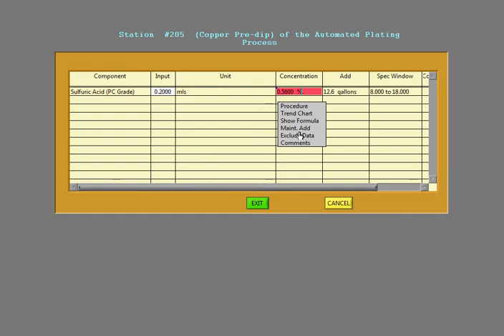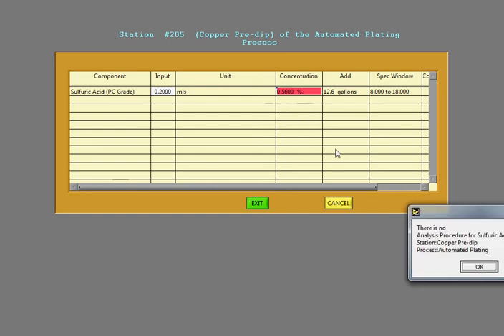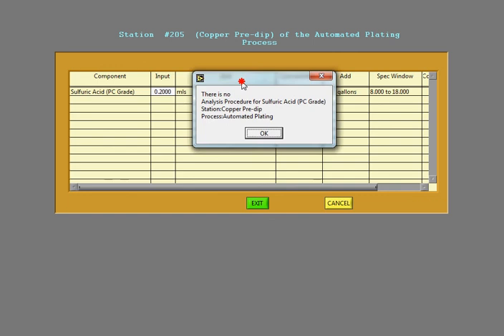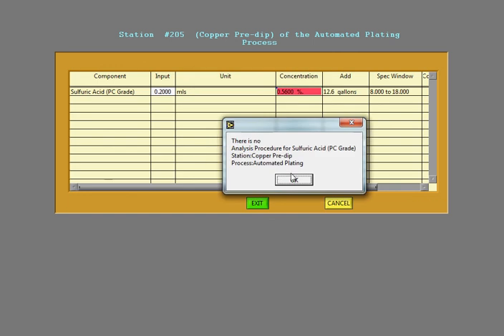So if we click on procedure, you can actually have a procedure set up here. In this case, there wasn't one. So it just says there's no procedure yet.